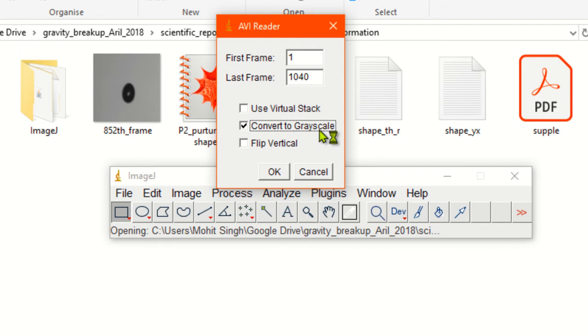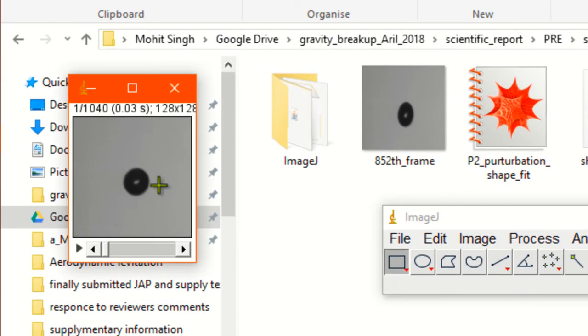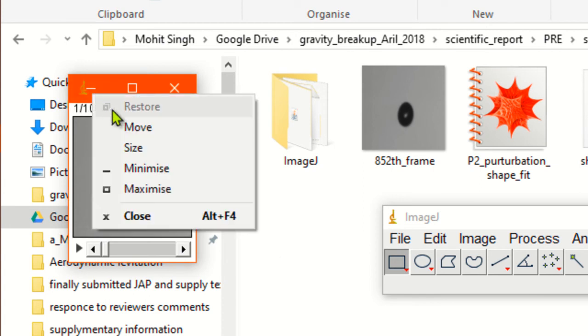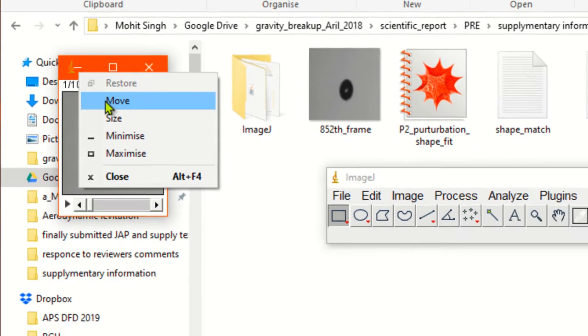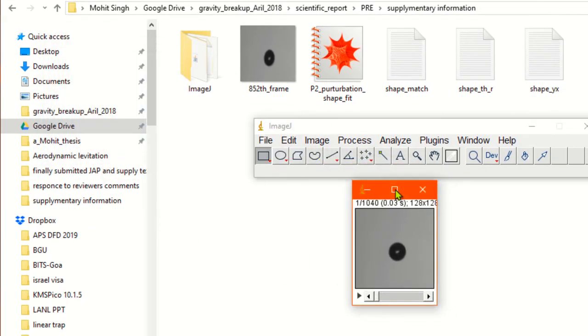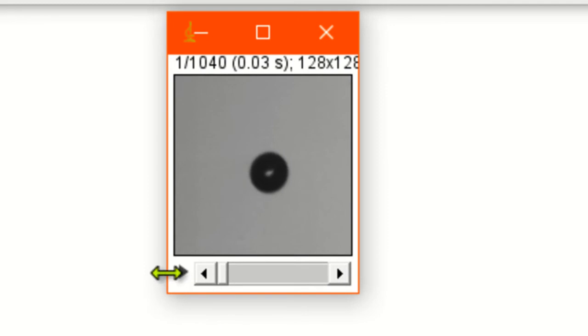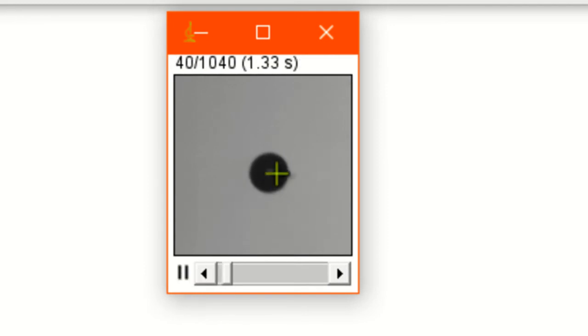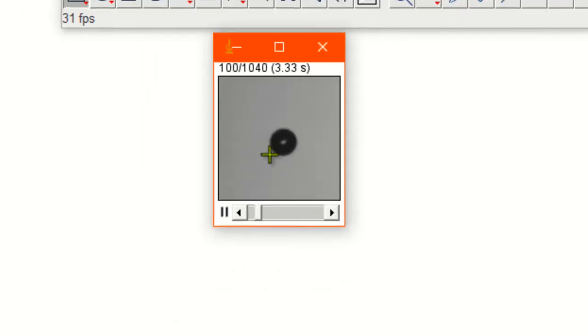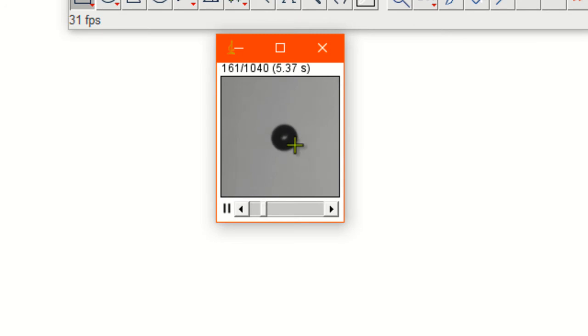Simply drag and drop. This is a high-speed video which contains deformation dynamics. Click on convert to grayscale. Let's move it to the center. I'm moving it to the center now.